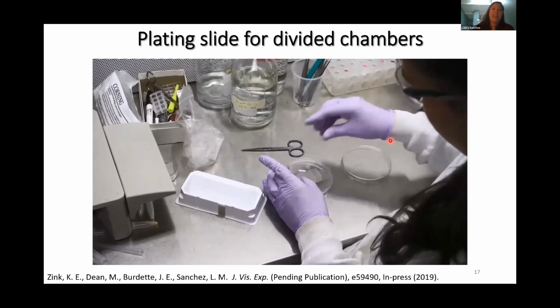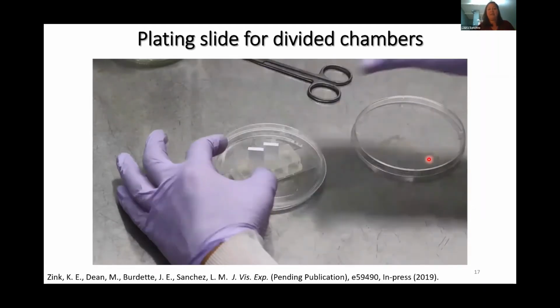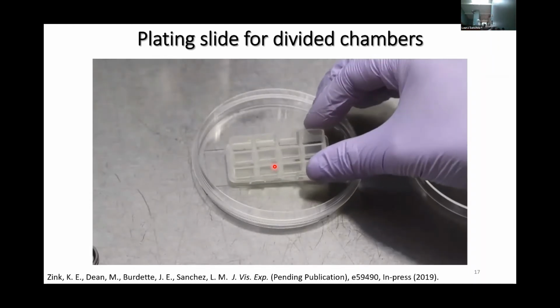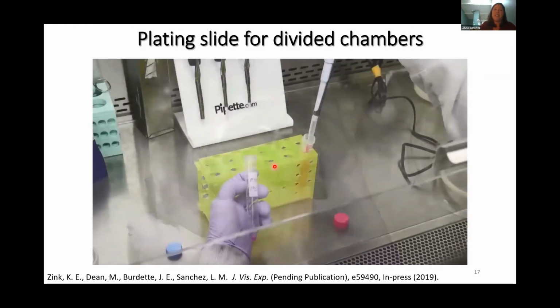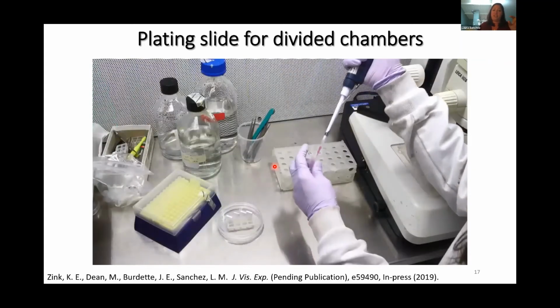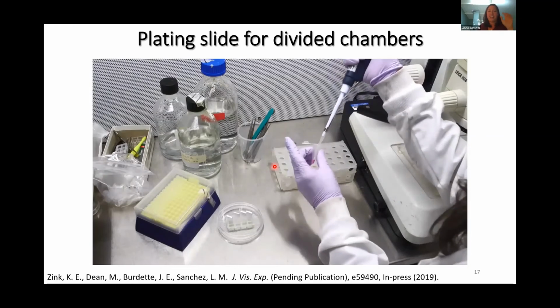So what we have now is, what Catherine takes is a sterile basin. She carefully measures these, sorry, the dog is going crazy now. Okay. We carefully measure these things and then wedge them in. So what we're going to do this time is to pour half of the amount of cells and agarose that we would have used for the full chamber into 1/2 of the well. Let that set.